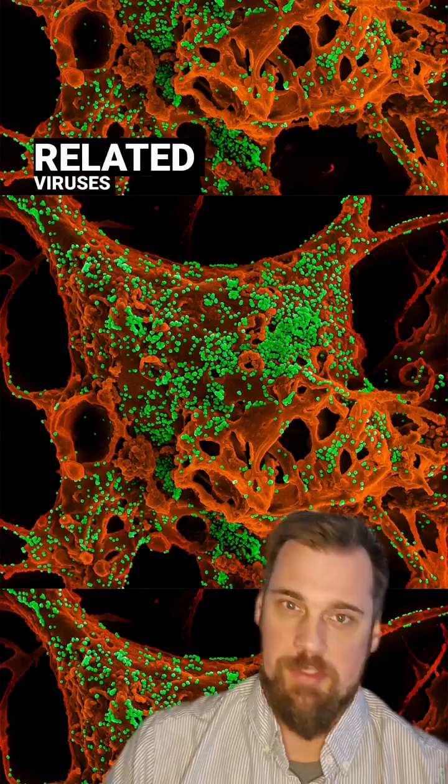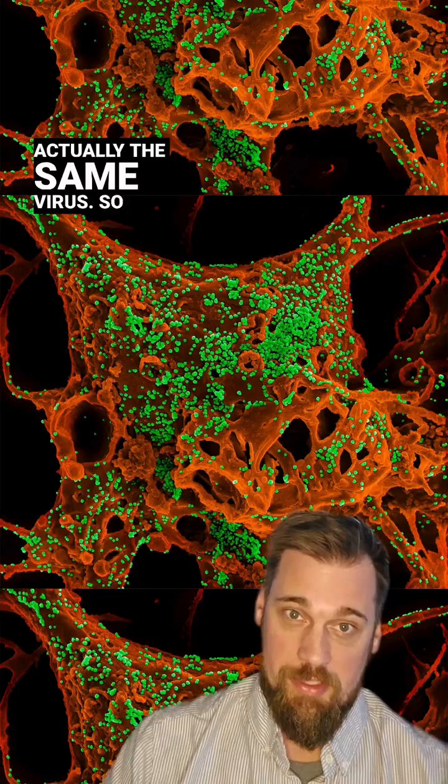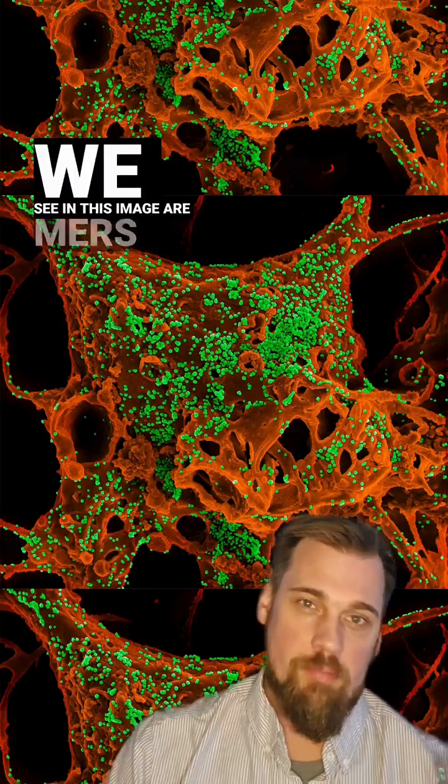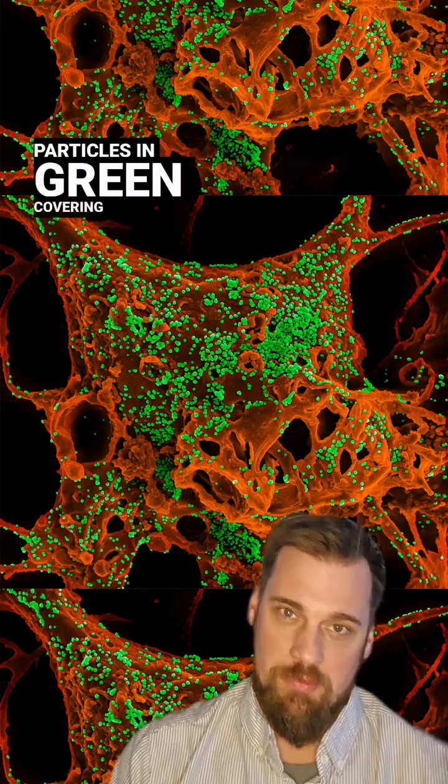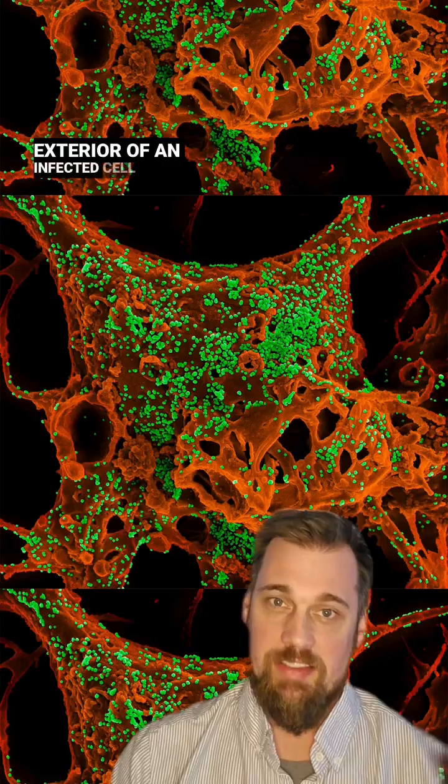These are related viruses, but they're not actually the same virus. What we see in this image are MERS particles in green covering the exterior of an infected cell in red.